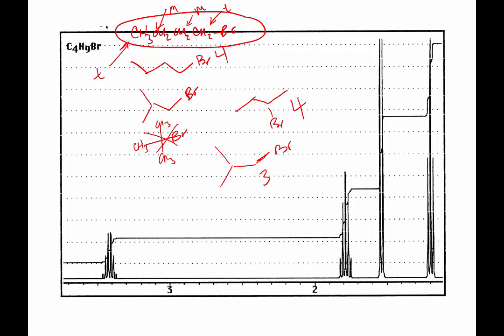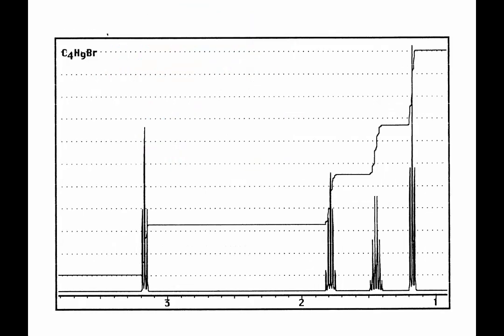So is there a spectrum with a triplet, multiplet, multiplet, triplet? Yes? Where is it? It's the next one. Triplet, multiplet, multiplet, triplet. Great.